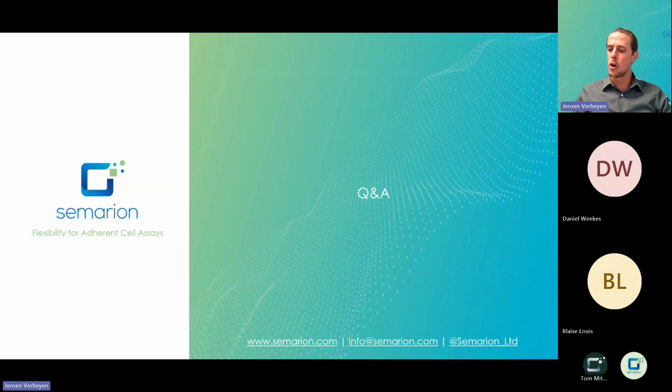So then there was more on the imaging and on the software itself. There was a question on whether or not the microcarriers can be analyzed through, let's say, Harmony software directly, or whether or not they need to be extracted and added to the SemaCyte software first. So if there's no barcoding involved, there's no need to extract these images and retile the SemaCytes into an image that's then analyzed downstream. Any sort of image analysis software, whether or not it's the Harmony software from the Opera Phoenix or so, can do that automatically.